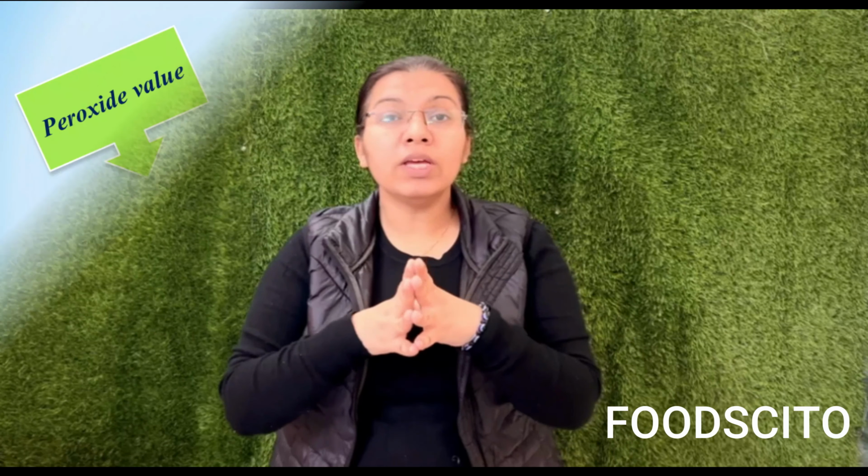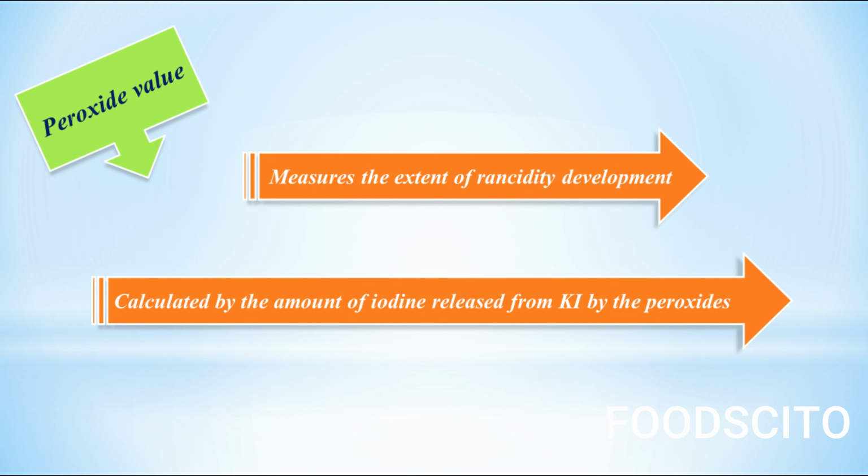Let's go through. If you remember, while discussing rancidity, I mentioned that during oxidation of fats, initially they break down into peroxides, which in turn break down into hydrocarbons, aldehydes or ketones. So from this statement, it's clear that by estimating the peroxide value of our product, we can measure the extent of rancidity. How is it measured? Peroxide value is calculated by the amount of iodine released from potassium iodide, that is KI, by the peroxide.